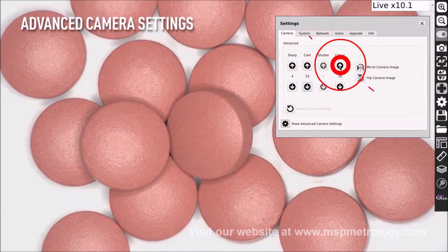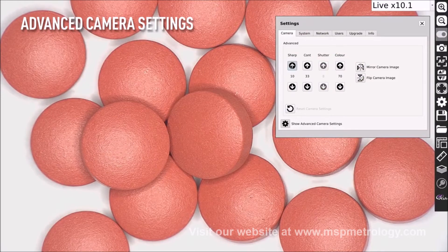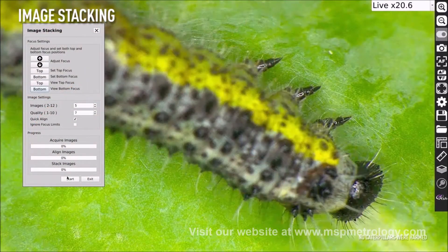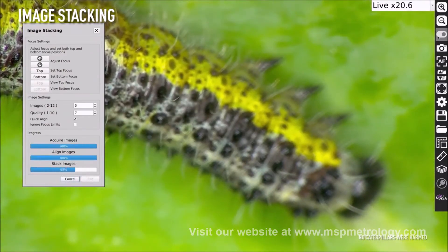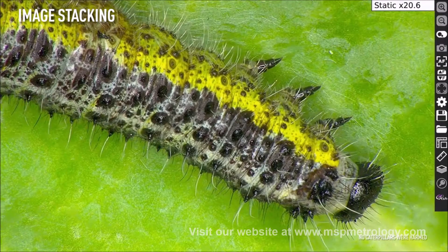The new, advanced camera settings give the user more power to enhance the image for a multitude of inspection and measurement capabilities. Image stacking: the enhanced image stacking feature improves image focal depth to create one high-quality, fully focused, sharp image.